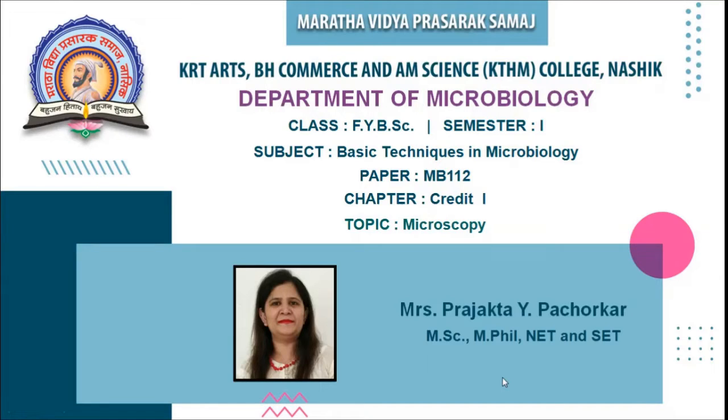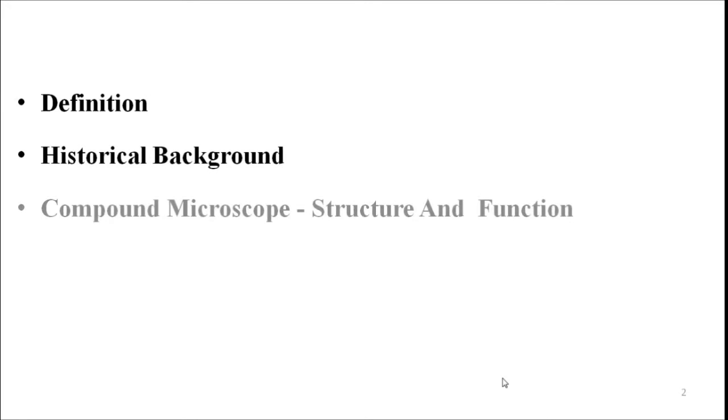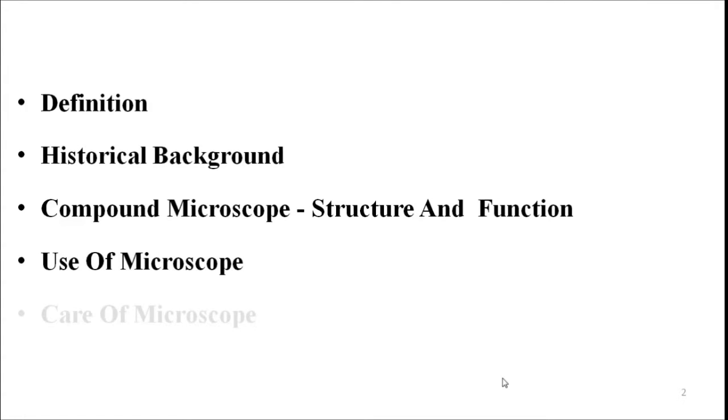Today we are going to discuss microscopy from the subject Microbiology paper 2, Basic Techniques in Microbiology. At the end of this lecture, the students will be able to define microbiology, microscope, and historical background. They will be aware of the structure and function of the compound microscope, how to use the microscope, and how to take care of the microscope.